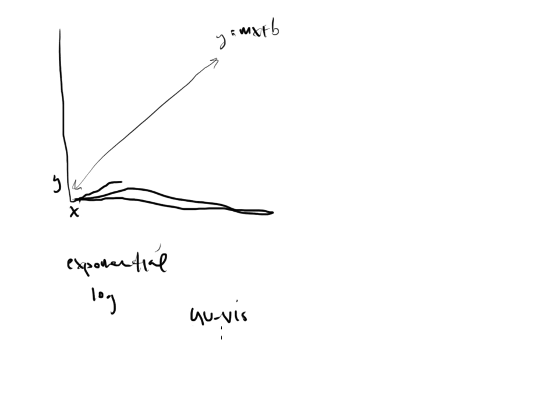So one of the things that we have seen traditionally in the field of UV-vis spectroscopy is that very often we would plot concentration in terms of parts per million or molarity or whatever the case. And years and years ago, we would plot a y variable called percent transmittance. And the problem here is that percent transmittance and the concentration were not linear. This was always a problem in the UV-vis spectroscopy world. So what we decided to do is get out of percent transmittance. We didn't like those calibration curves. We didn't like that it wasn't linear.